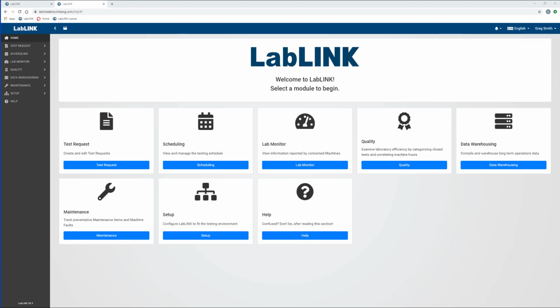For security reasons, any document type that needs to be attached to a test request must have a corresponding file extension set up for it inside of LabLink. To do this, a system administrator will need to, under their account, go to System Configuration.